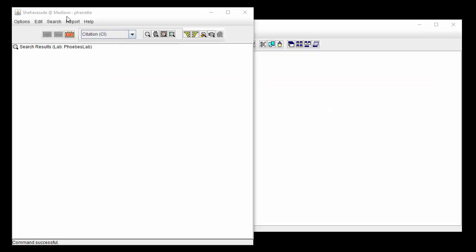The calendar view is used to create various calendars for your lab to schedule, reserve, or track events, production schedules, room or instrument reservations, etc. Today, we'll create a calendar to function as an ultracentrifuge sign-up sheet. First come, first served. The calendar will be open to all members of the lab and will allow read-write permissions. For this simple calendar, we will also only need to show who has taken a calendar slot.